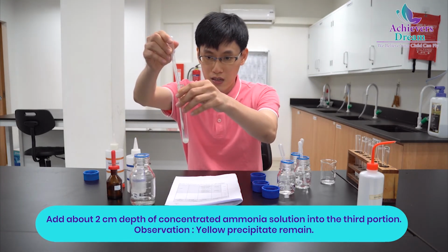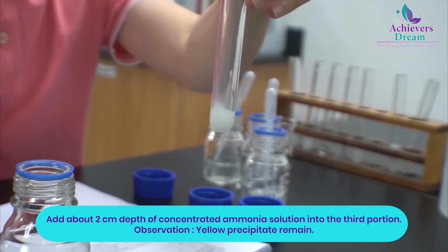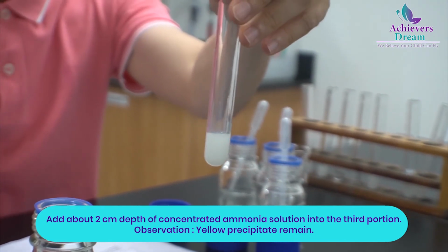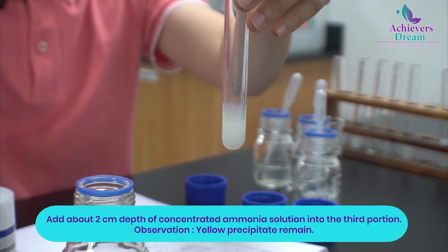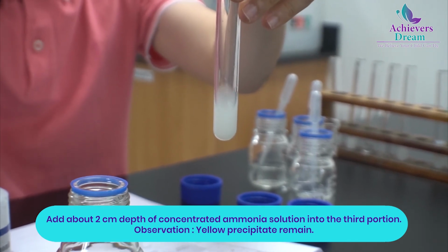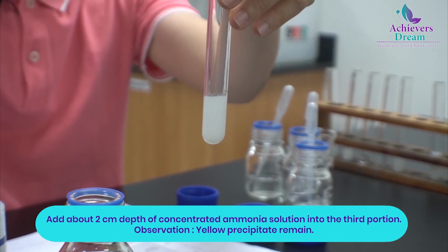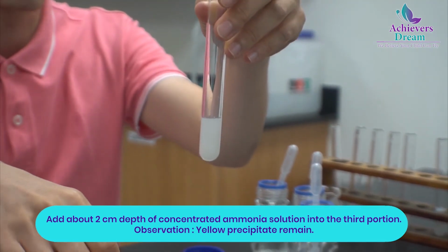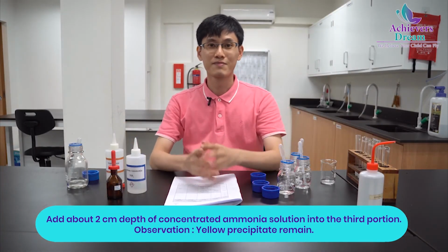So I'm going to add concentrated ammonia. As you can see, the precipitate is still there. Let's add some more. Precipitate is still there. It's not dissolving at all, unlike the silver bromide example that we saw just now. So that's the halide ion test.